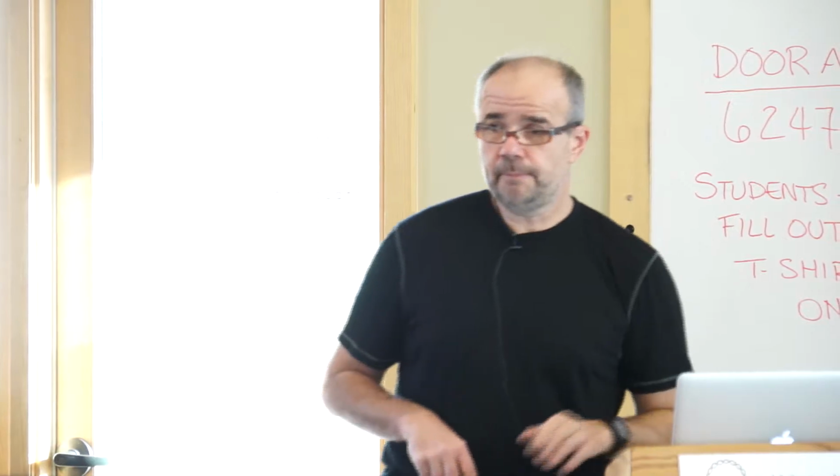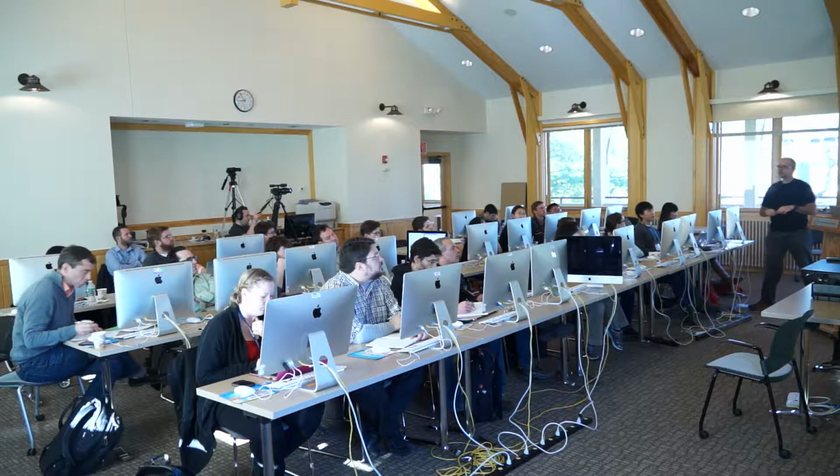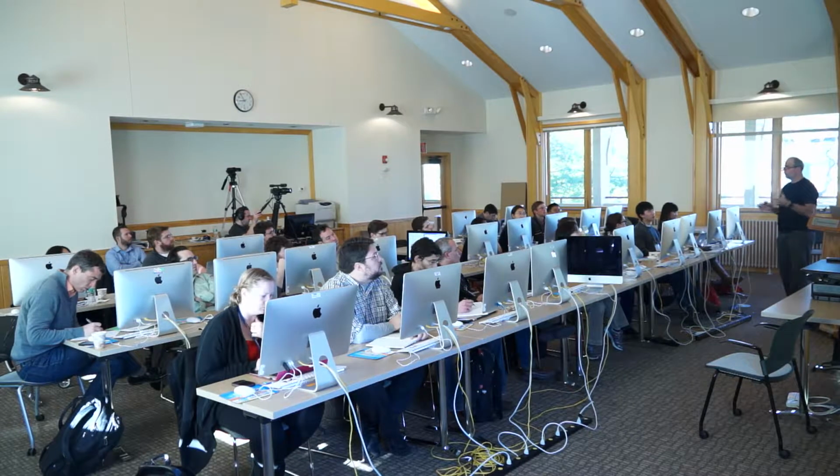Okay, so yeah. Is this local realignment built into normal aligners? To some degree. Every aligner will have some algorithmics of how to do the alignment, and some put some of this information in there already. There are programs that do nothing but realignment. For example, the GATK has a realignment step where they take known insertion deletions, like if this was a known variant, a known insertion deletion, and they try to see if the reads would map better with that insertion.